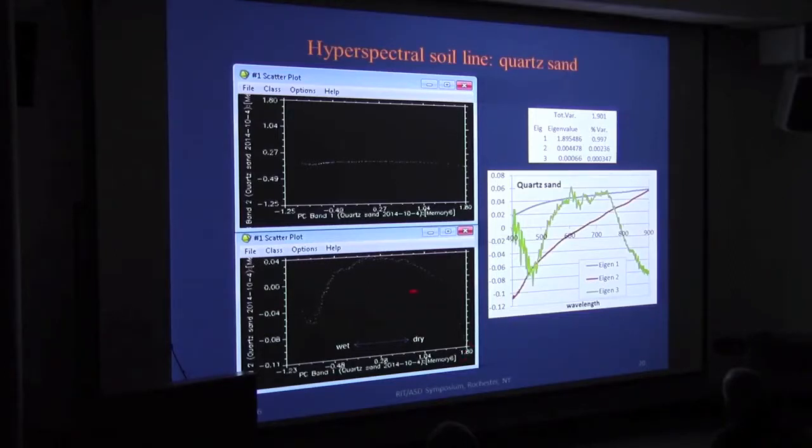Okay, this is not noise. There's something organized going on there. I don't know what that is, and if anybody has any thoughts, please let me know. I don't understand why that's not just random noise.